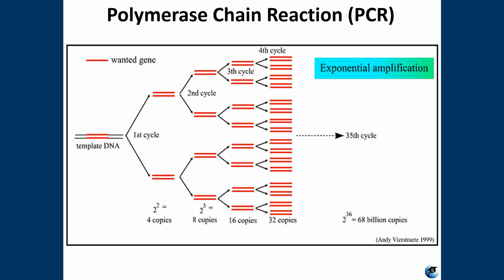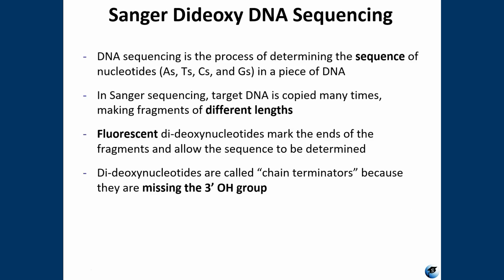It's really awesome. A basic sequencing technique is called the chain termination method, which is also known as Sanger Dideoxy DNA sequencing. It was developed by Frederick Sanger in 1972.